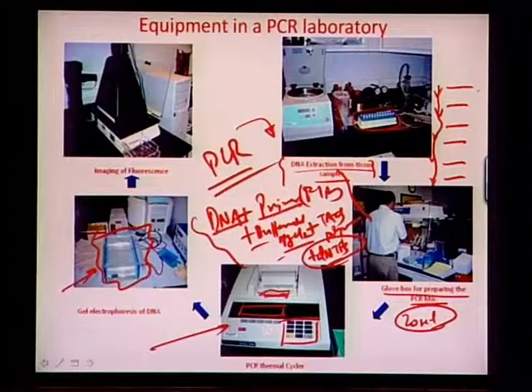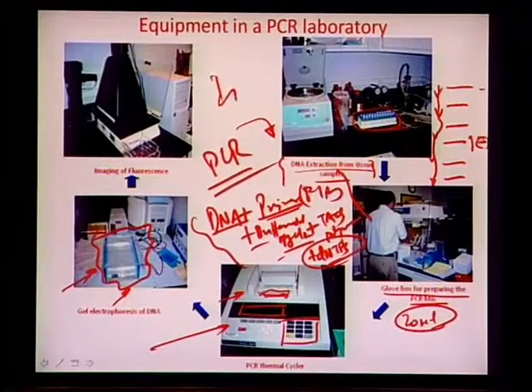If the amplified sample is run parallel to it and forms a stain between any of these two marks, you can identify the size segment. So whether amplification has happened or not, based on the primer used for selection and the segment amplified, gives full data about the nature of the DNA, and it would be used for identification of the dreaded IBR virus.